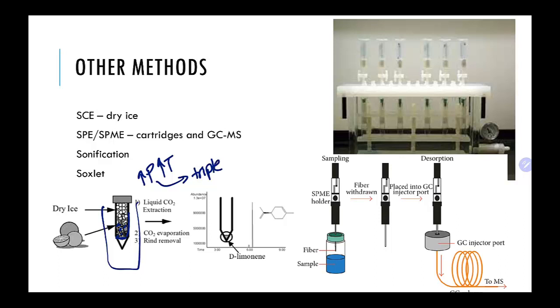It's a point at which carbon dioxide is a gas, a liquid, and a solid. And why I point that out is because normally we'll never see carbon dioxide as a liquid, because at room temperature it can never be a liquid. But if you use enough pressure, it can become a liquid. And why is that important? Carbon dioxide is a non-polar liquid when it is a liquid, and it can help us extract our carvone out, or limonene, or anything like that. So I mostly do this with limonene.